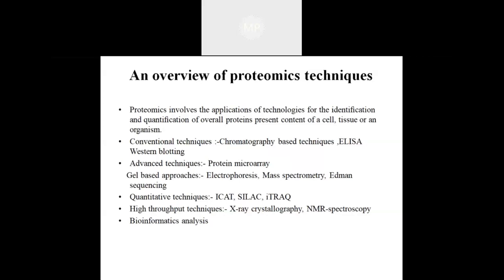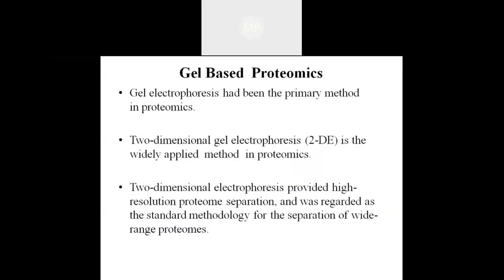In one session, it's quite difficult to elaborate all the techniques. So according to my presentation topic, I am going to explain the gel-based approaches, mainly focusing on 2D electrophoresis, and some quantitative techniques like ICAT, SILAC, and iTRAQ. This is the next slide.